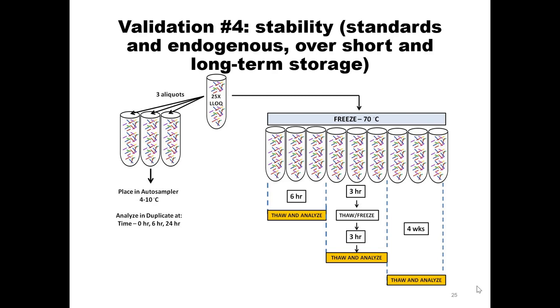Yeah. There was a similar experiment done on breast tumor samples, I believe, where they either harvested and froze immediately, or harvested and waited a bit and then froze. And I think the take-home message is, if you have particular targets or analytes that do degrade very quickly, you wouldn't measure those. You would try to find a different target that's not degraded. If it's already happened with the samples, it might be a good test to do if you had a reference material, like some reference plasma sample, to see if any of your targets are affected that way.